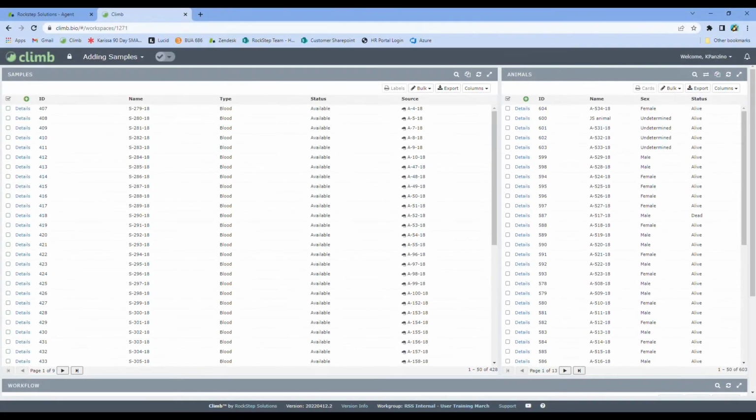In this video, we are going to go over how to add samples within Climb. To add a sample, first we are going to go into our samples facet. This facet is where detailed records of all samples that have been added to the system lives.